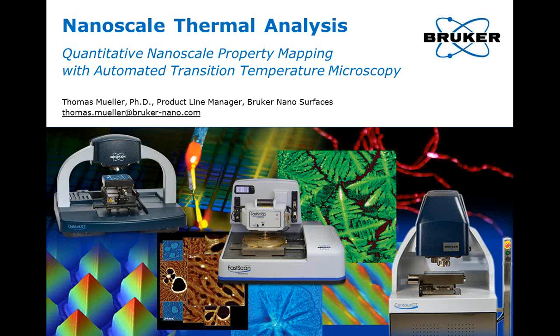This is titled Nanoscale Thermal Analysis: Quantitative Nanoscale Property Mapping with Automated Transition Temperature Microscopy, presented by Thomas Mueller.